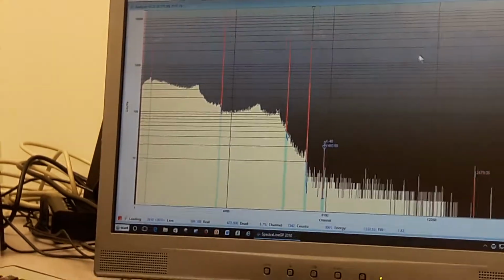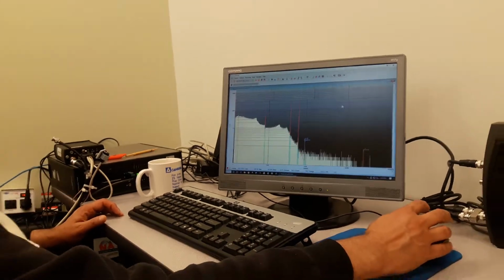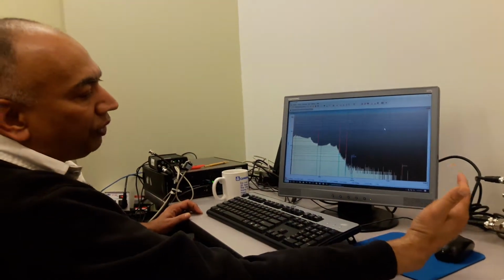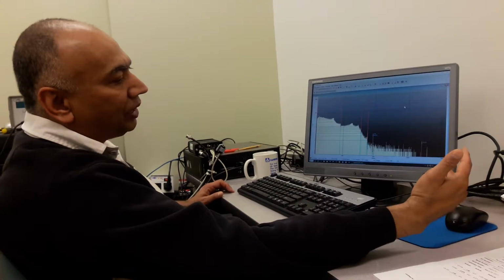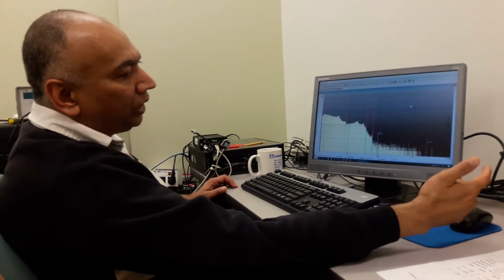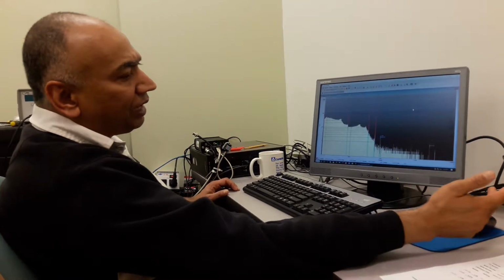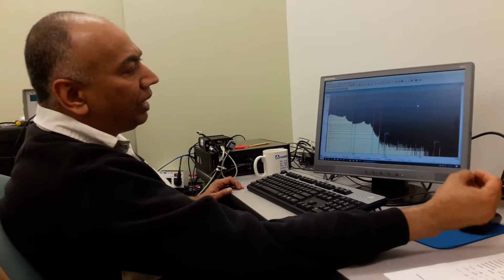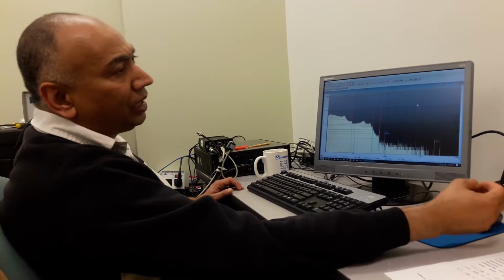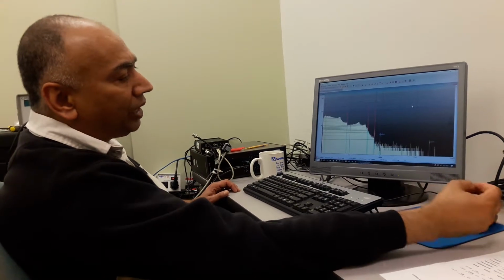So now that concludes basically the operation of the SpectraLine GP software with loading the configuration parameters, doing an energy calibration, peak locate, peak smoothing, full width half maximum calibration, efficiency calibration, creating a certificate file, doing an efficiency calculations, nuclide identification and activity calculation, reporting and report editing.